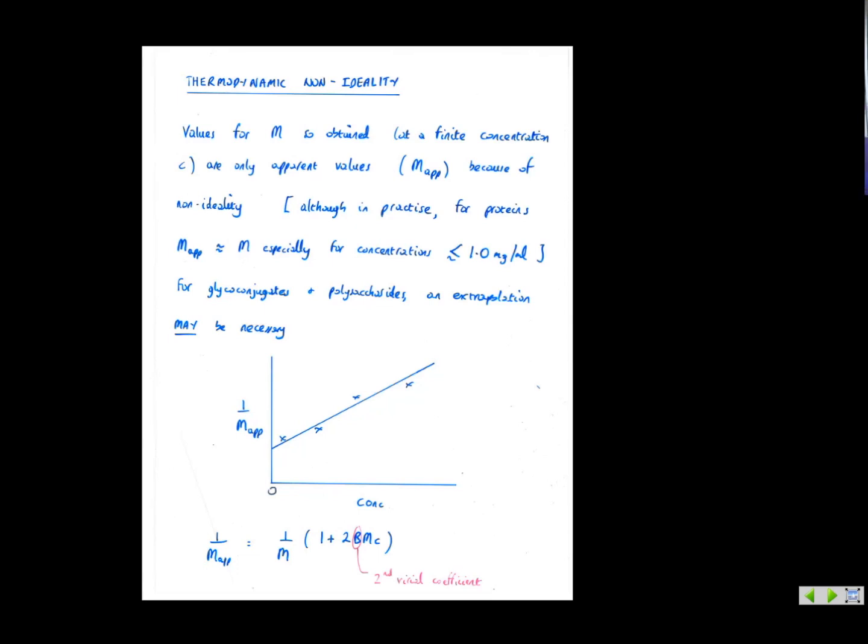Because of the much bigger size of macromolecules compared to solvent molecules, and for any unsuppressed charge behavior.